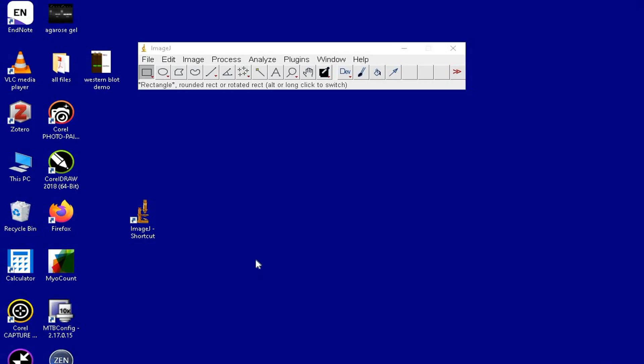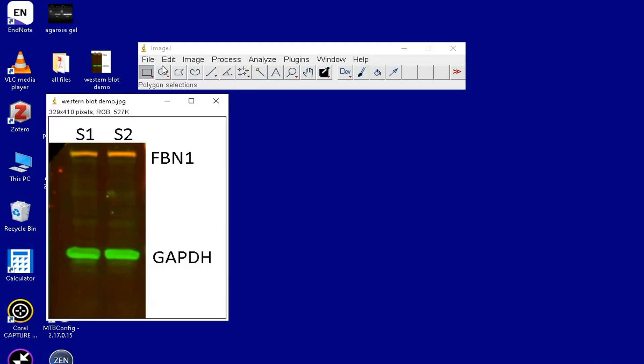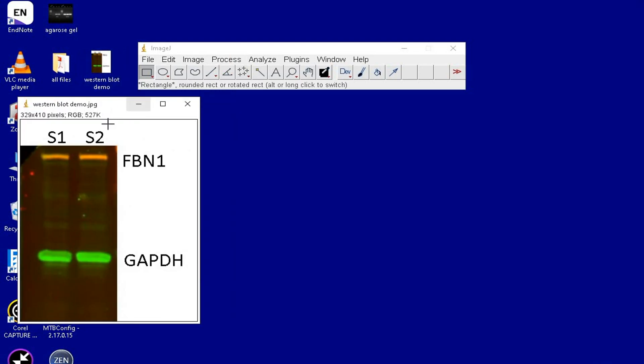For this tutorial, let us import a western blot image by drag and drop method onto ImageJ. In this example, the blot image on the upper side in red shows the fibrillin 1 bands consisting of sample 1 and sample 2.